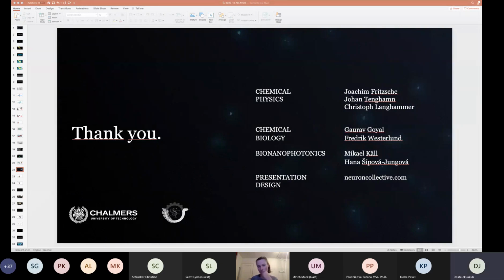Yeah, but lots of biological systems, like protein interactions in lipid membranes, require this kind of environment. And I think your channels are too narrow to load in lipid vesicles or stuff like that. But maybe you can make them wider. Coating of nanochannels with lipid bilayers is a standard thing that our colleagues at Chalmers are doing for different purposes, basically studies of DNAs. The lipid bilayer is something we could push inside.